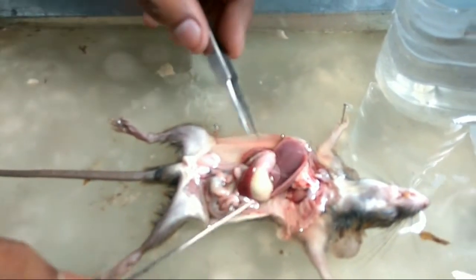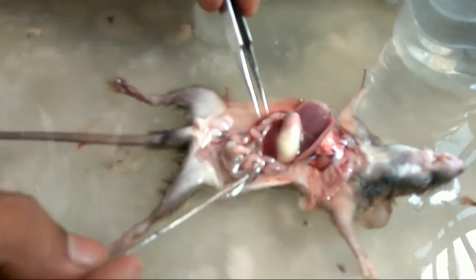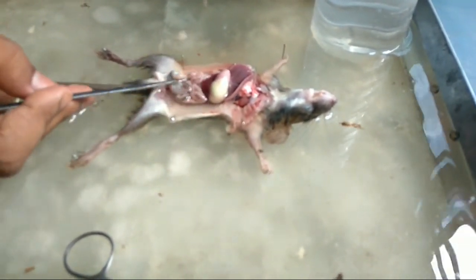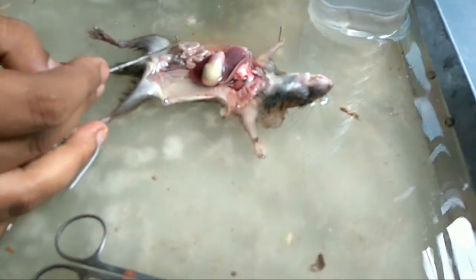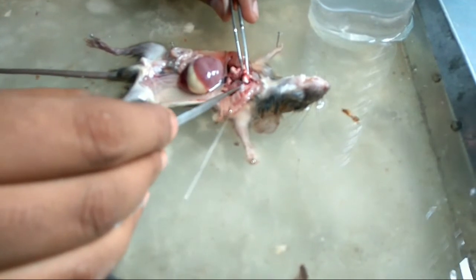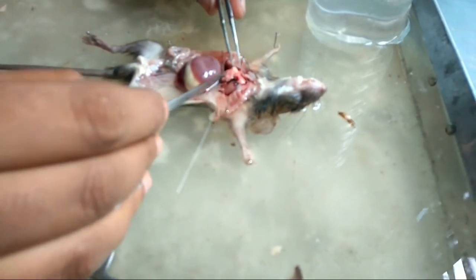This is the urinary bladder, and here are the small and large intestines. This is the liver. In between the liver and lungs you can find the diaphragm. These are the lungs, somewhat pink in color.